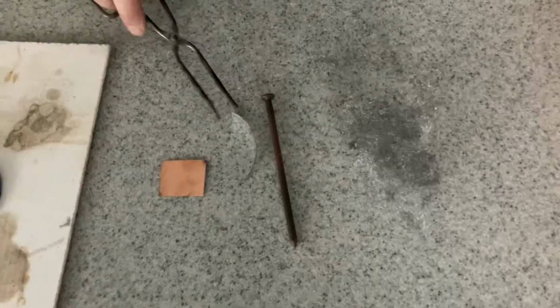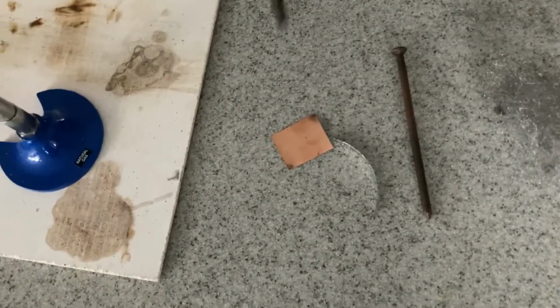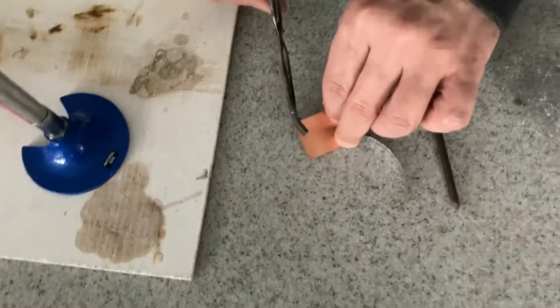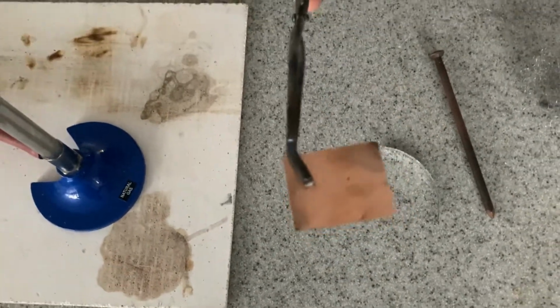Right boys, I am going to try and burn several different metals so we can see the difference in reactivity between them. Wow, that one's got a mind of its own. Firstly, let's do copper. Copper, let's have a look. It is a sort of orangey colour. Let's whack it in the burner.